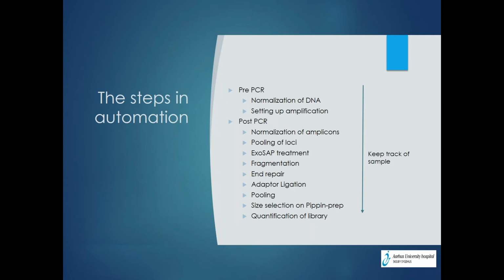Low requirement for dead volume. You can say what you need to look for is a pipetting station that is able to pipette small volumes and not using a lot of excess volume. When you get a kit, you are sort of limited by the content of that kit. I saw this as a rather big obstacle in the beginning, but it hasn't really turned out to be, because of things I'll show you and talk about a little more later.